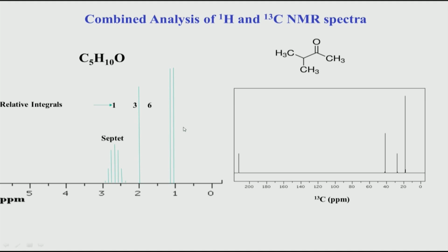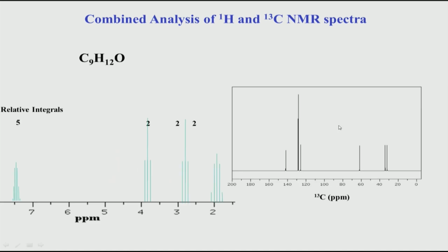So, right now we are looking at this spectrum in isolation, separately from the other. But a combination of these two would also give me the information as to which carbon peak here matches which carbon-proton pair here. That information is not in this, because we are looking at separate 1D spectra. So, let us come back to this particular case.